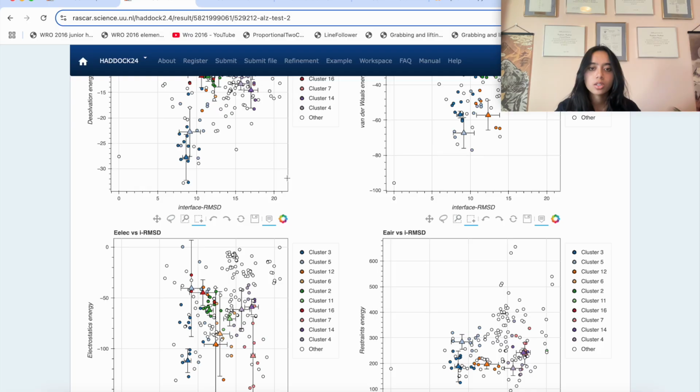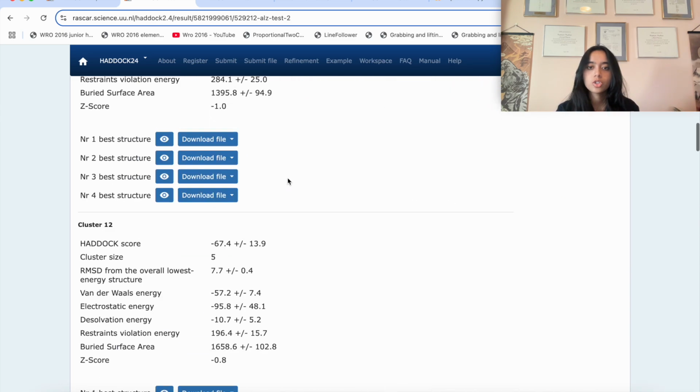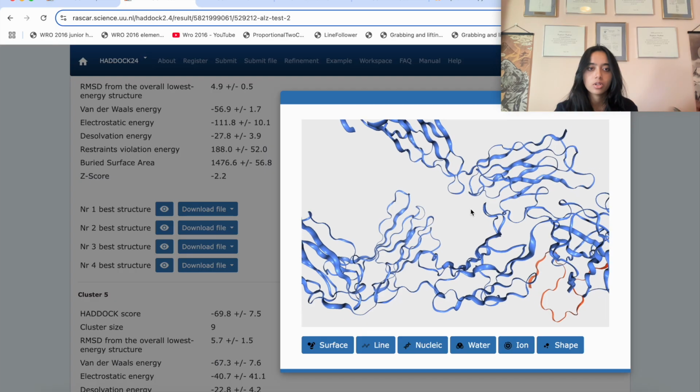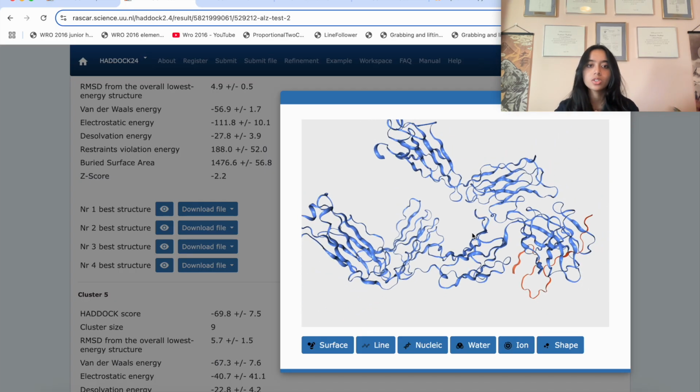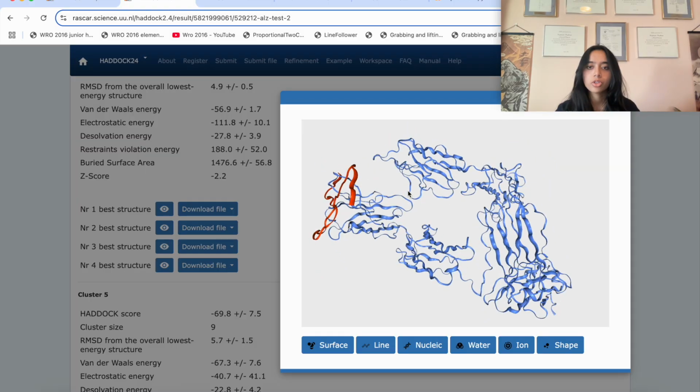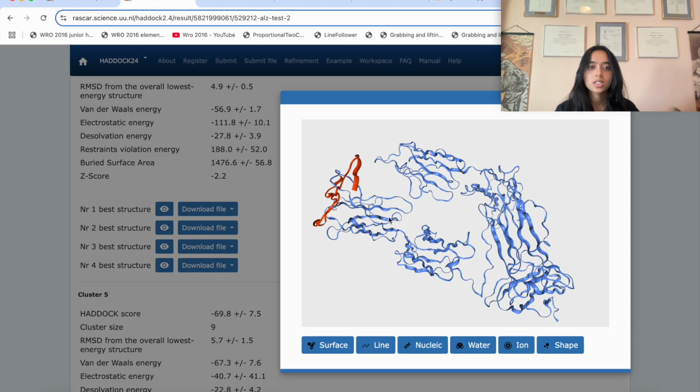I'm not going into their details in this video. If we visualize the docking, we will see that it shows a good and tight fit in the Fab region of the antibody. We can now use this drug-protein complex PDB file to analyze further properties, such as its stability in the cerebrospinal fluid where this has to act.